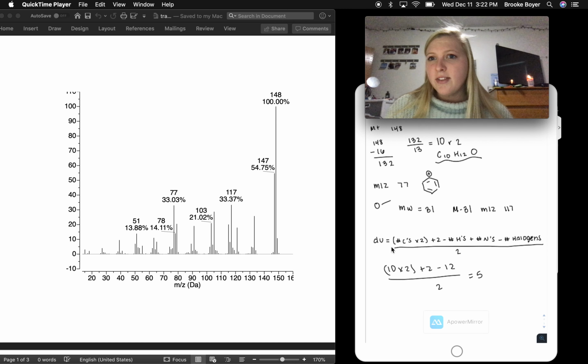So this was the first half of the video. In the next half of the video, I will describe a carbon and hydrogen NMR to go along with these two.